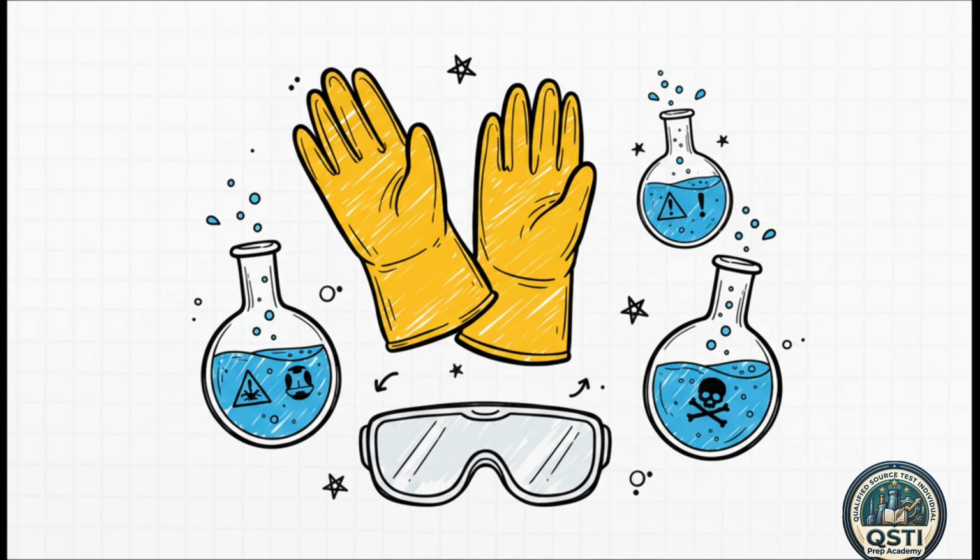Quick safety check here. ORSAT and Fyrite analyzers don't run on magic. They run on highly corrosive chemical reagents. We're talking about heavy hitters like potassium hydroxide, sodium hydroxide, cuprous chloride, zinc chloride, and hydrochloric acid. You absolutely do not want these on your skin or in your eyes. So follow the manufacturer's operating instructions to the letter and strictly observe all those warning labels. Do not cut corners with these chemicals.